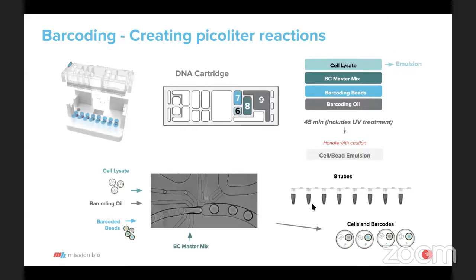Emma, and again, question. Yes. So while you're waiting for the first incubation to activate the protease, how would you suggest storing this very precious cartridge until you get to this step?